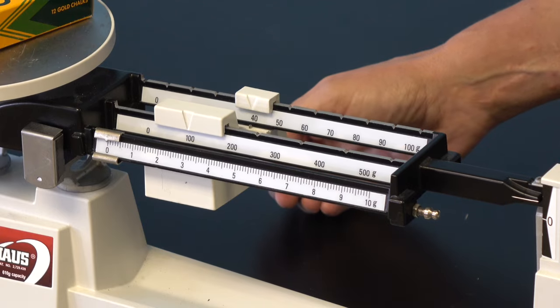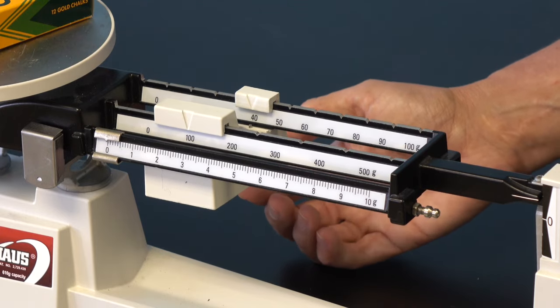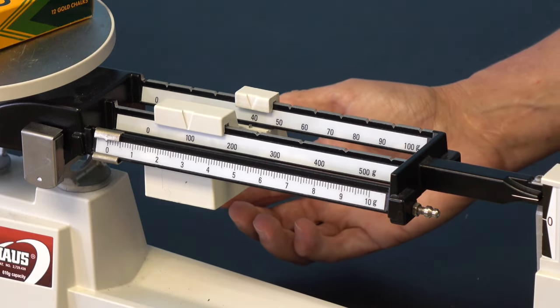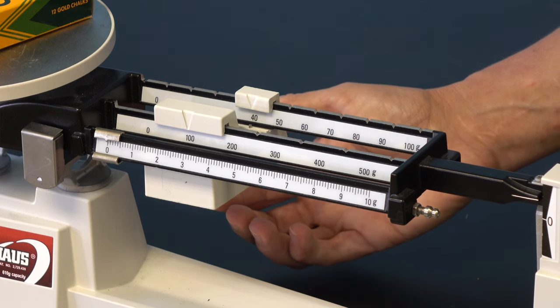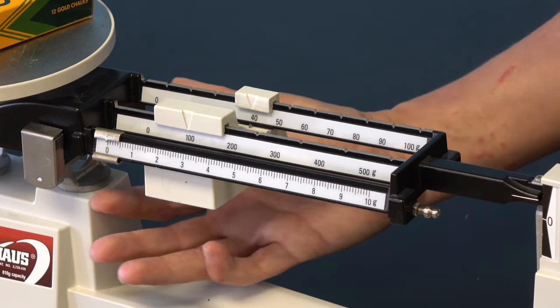Third, the front rider is moved. There are no notches on the front beam. This rider is gently moved until the pointer exactly matches up with the zero mark.